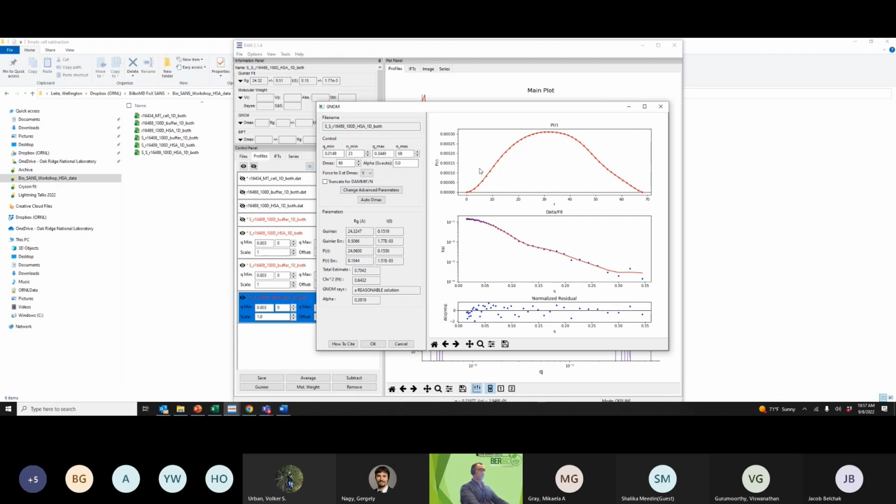Let's see now. You can start adjusting your D maximum. Okay, it's not a good solution. Go back. See if I remove those noisy points here. I can definitely go for this, so this is the good one.